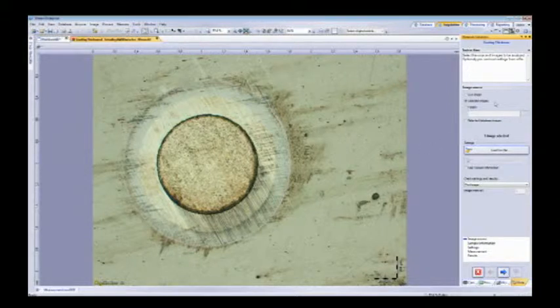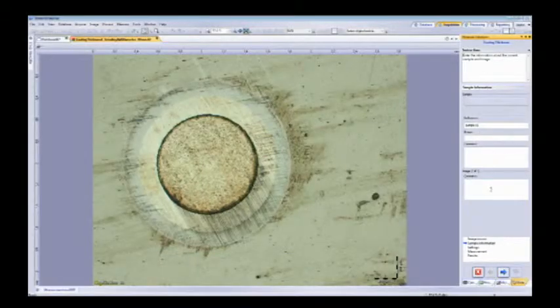Exactly. So all of these solution modules, they work as a workflow, just next kind of buttons. They all give you instructions at the top. We hit next here. We can type in a lot of information for our samples. Customers are usually going to have hundreds of these pictures that they'll want to process through, and this solution module can batch process those. All of our solution modules can do batch processing. And we hit next here.